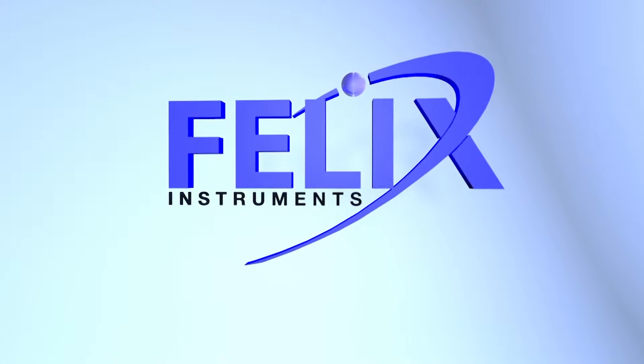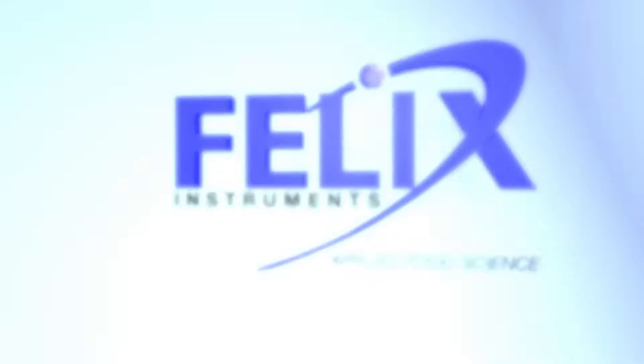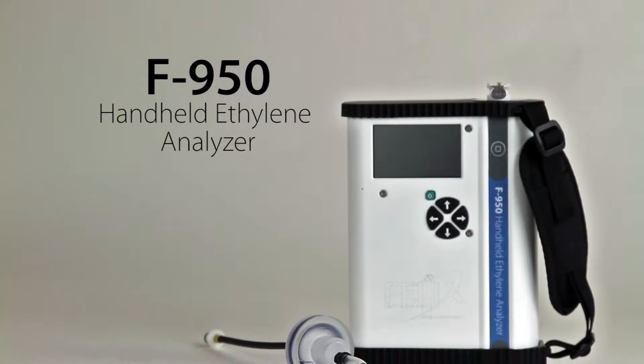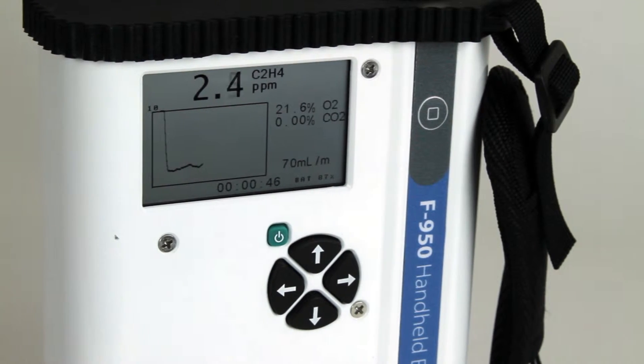Felix Instruments Applied Food Science presents the F950 Handheld Ethylene Analyzer.